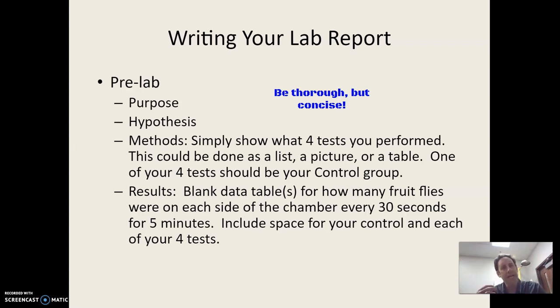So again, you want to try and answer the question as much as you can. So I think 4 tests should help you do that, but it means you have to be very specific in what you're going to do with those. So you're just going to list them, draw a picture, table, whatever is easiest, but just kind of communicate to your teacher what your tests are.